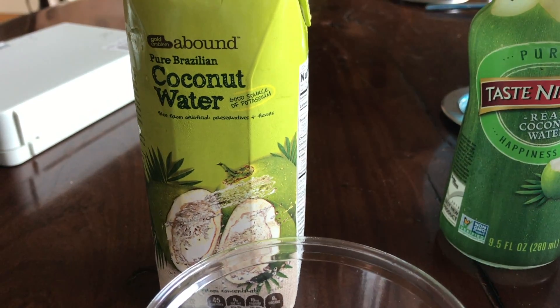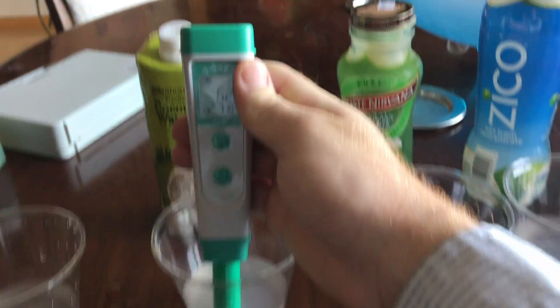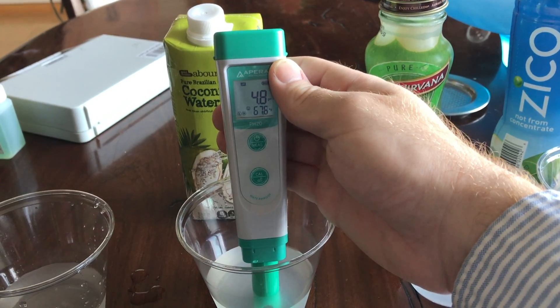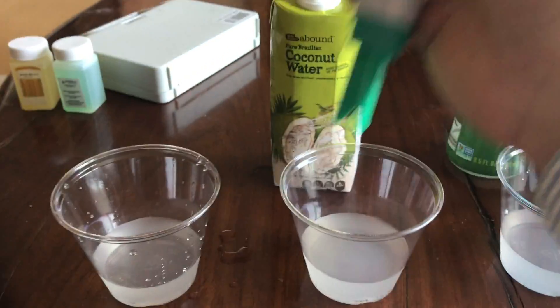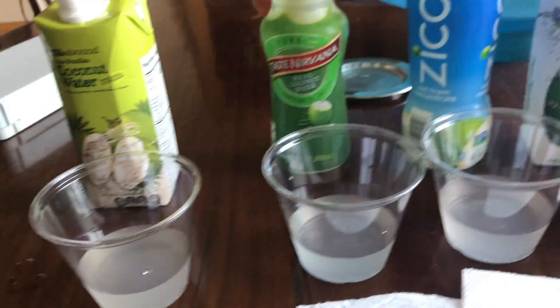Abound pure Brazilian coconut water, free of artificial flavors or preservatives. Let's test the pH. 4.9. So that's around 10 times more acidic than natural coconut water. Now I'm just going to recalibrate it again and move on to the next one.